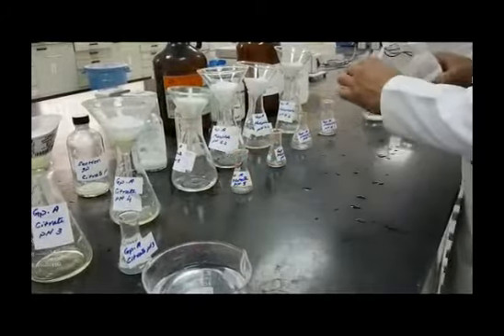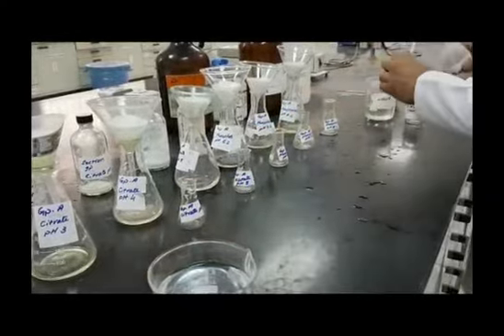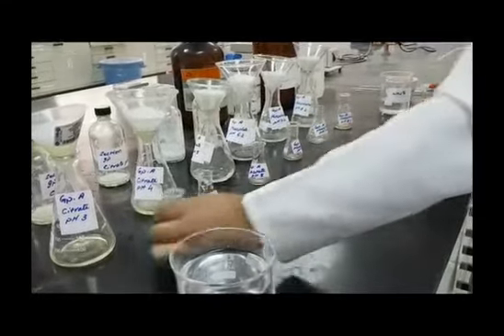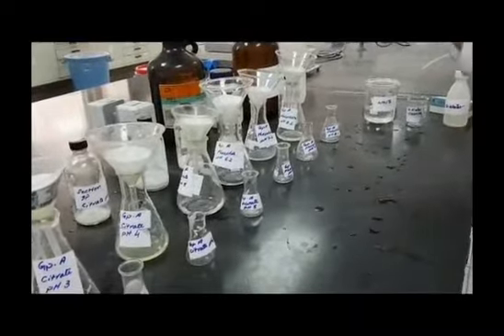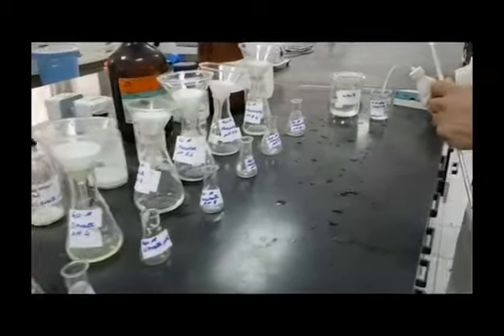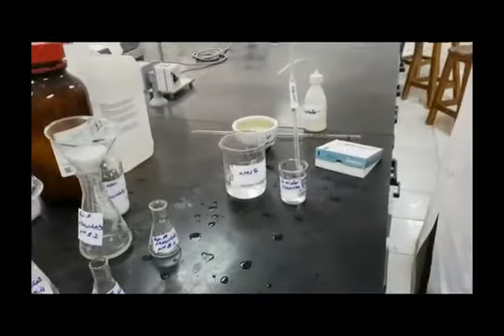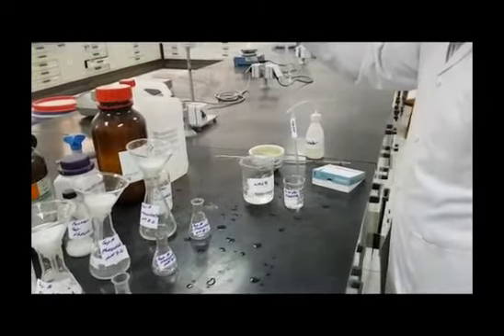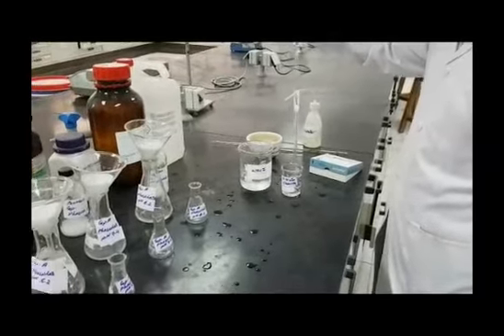This will be done by accurately measuring equal volumes, which means that two volumetric pipettes of the same volume should be used. Here we are using 10 ml volumetric pipettes. One should be labeled as sample and the other one as sodium hydroxide, NaOH.